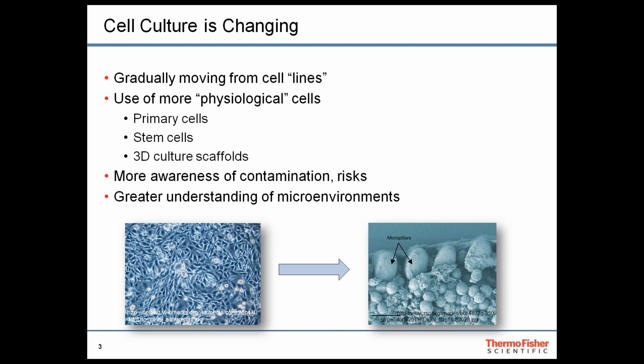So one new development that I think is really exciting is growing cells in 3D, and how that facilitates more physiological communication among the cells. And along with growing cells that are more fragile and harder to keep growing, there's also more awareness of the perils and risks of biological and chemical contamination. So that gives us a greater understanding of tissue microenvironments and how conditions vary depending on where the cells are located within an organ or tumor, due to new research.